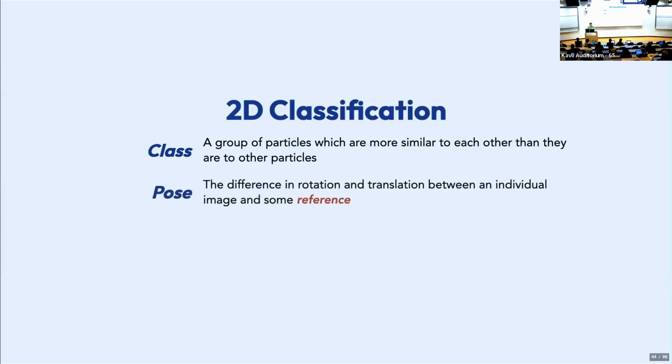This is where I'm going to really kind of try and define a pose. The pose is one of the most important concepts in cryo-EM. I'd say arguably the most important concept in image processing. So I really want to hit this home. A pose is where we compare a reference to a particle image, and we say what rotation and translation do we have to apply to that reference to get it to match the image. I'm sure you could find other definitions of pose, but that's the one I'm going to be working with here.